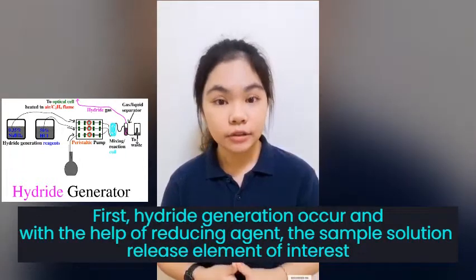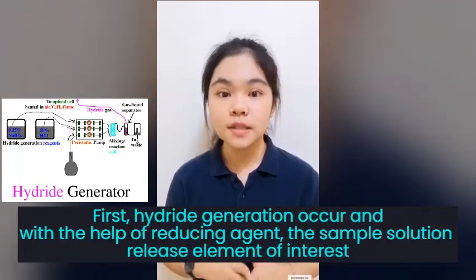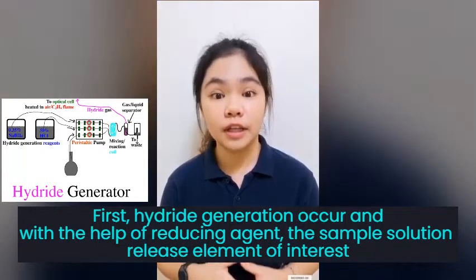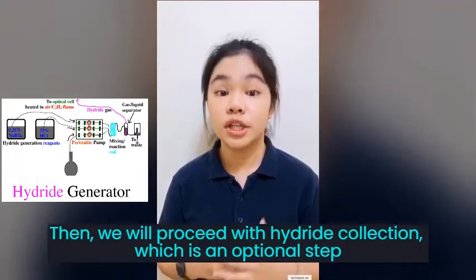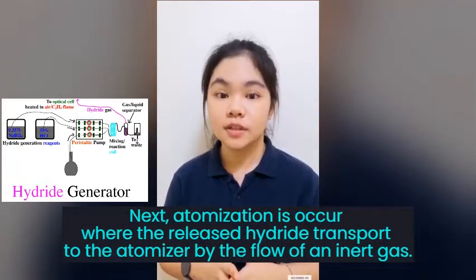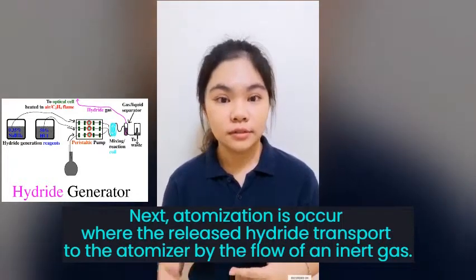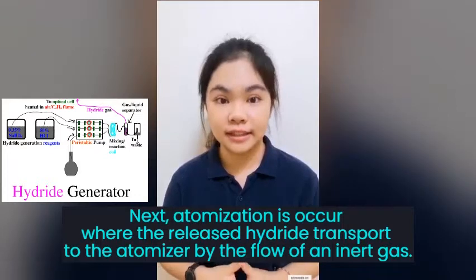First, hydride generation occurs, and with the help of a reducing agent, the sample solution releases the element of interest. Then, we proceed with the hydride collection, which is an optional step. Next, atomization occurs when the released hydride is transported to the atomizer by the flow of an inert gas.